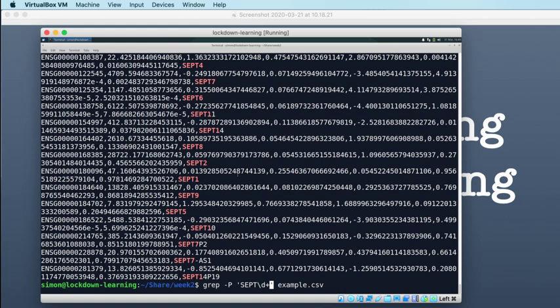And this will still match everything that was matched before, because this pattern will still match this sept7 AS1, for example, here, because this consists of sept and then one or more numbers. So it will still match. The way to restrict this now to just the ones that we're interested in, so to just the septins without the P's or the AS's or anything like that, is to restrict this match to being at the end of the line. So we're interested in this particular pattern, but we only want to see that pattern at the end of the line.